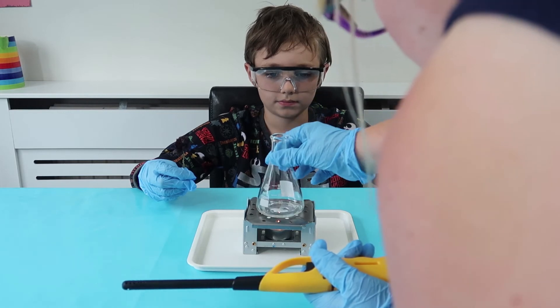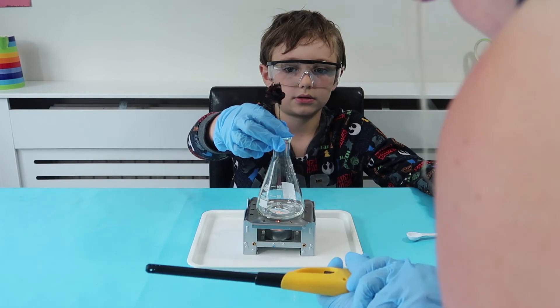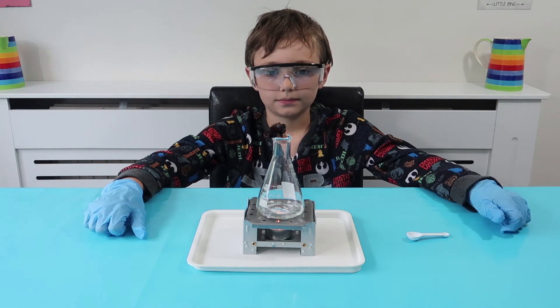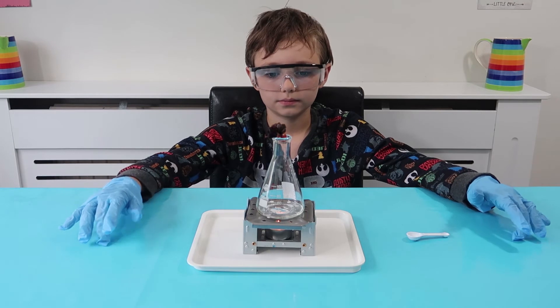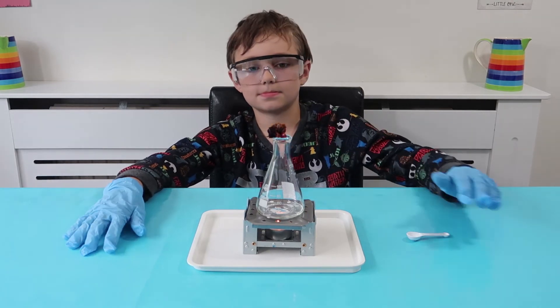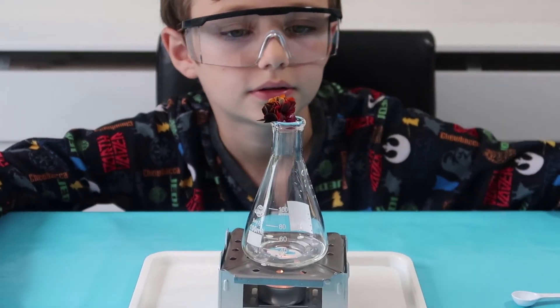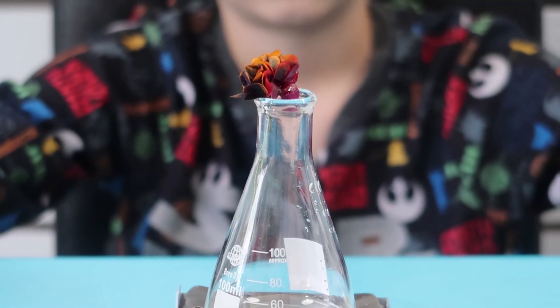Now we're going to pop this solution on top to heat up, and you need to put that flower on the top of there — just drop it in, that's it. So now what should happen is that it's going to form sulfurous acid and then the acid-base indicator is going to react and change color. If we heat it up for about three minutes — oh actually, you can already see it changing! Do you see what's happening to the flower? It's turning red! Let's see if we can get a good zoom in on that — look at that everybody.